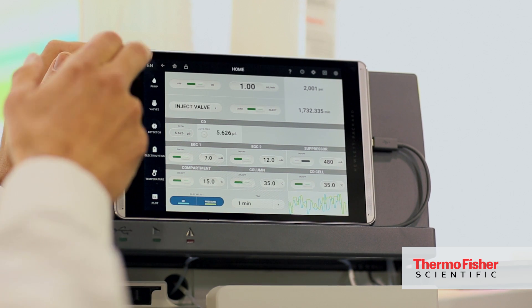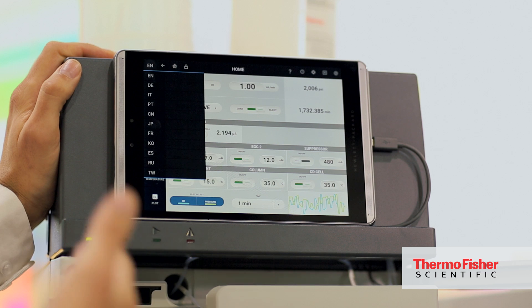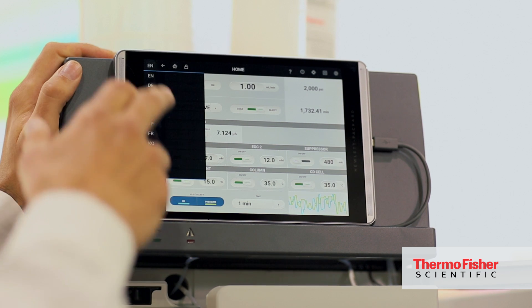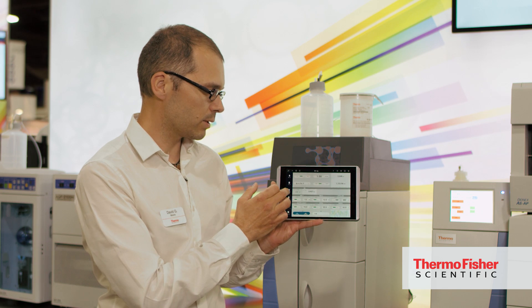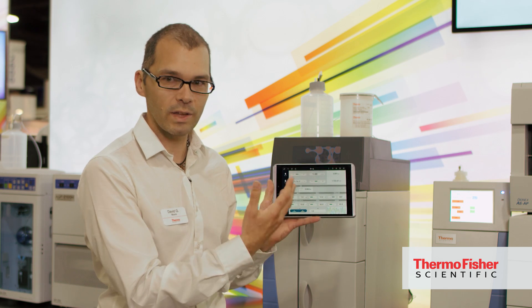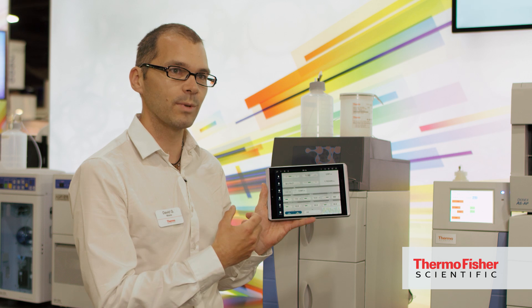Some of our customers, especially abroad, don't have English as their first native language. So we do have a simple option to switch to alternative languages. For example, we can switch into Japanese and then the customers can read the instrument in Japanese.